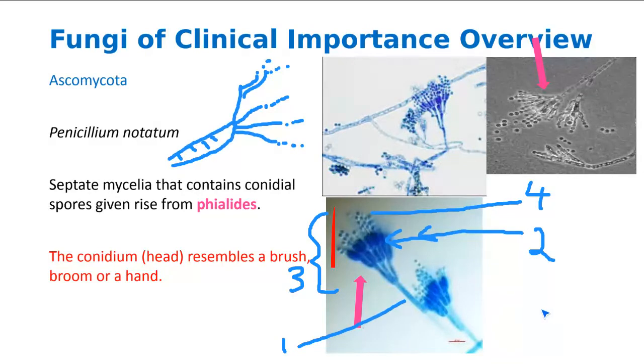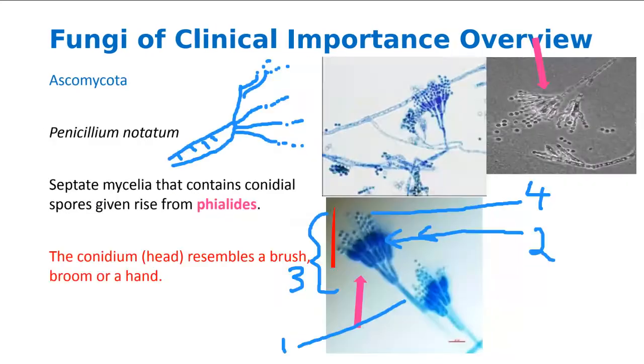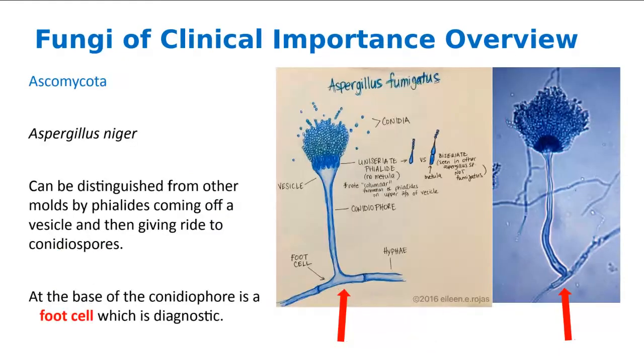All right, let's talk about, anybody have any questions about Penicillium? All right. Let's talk about Aspergillus.